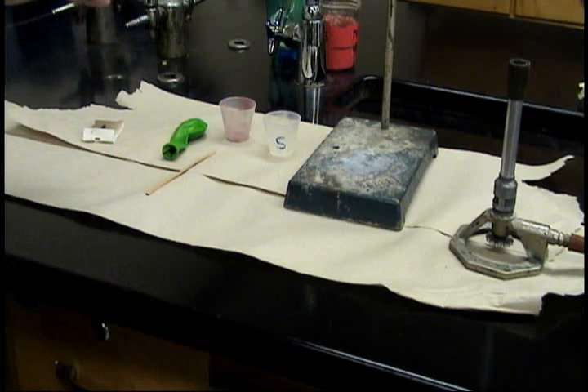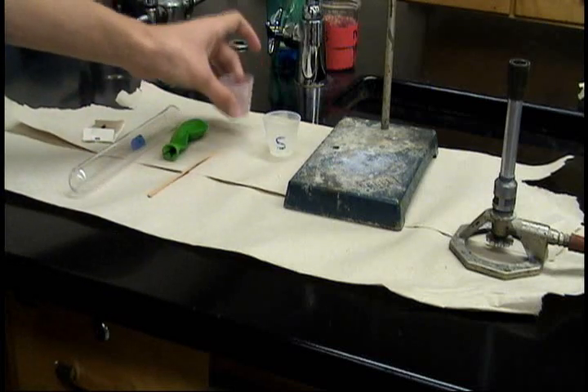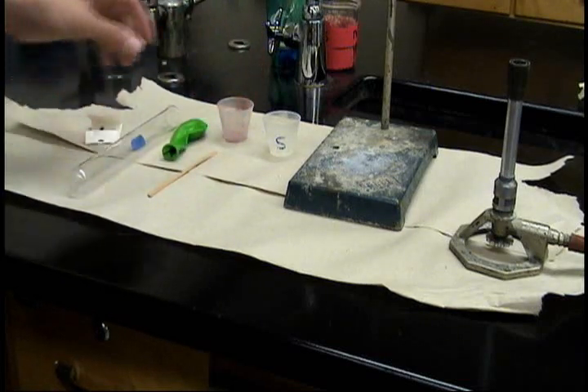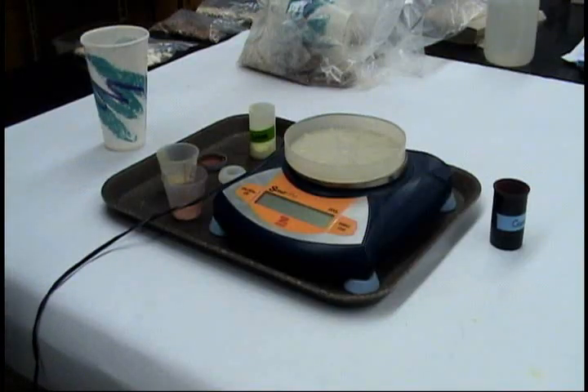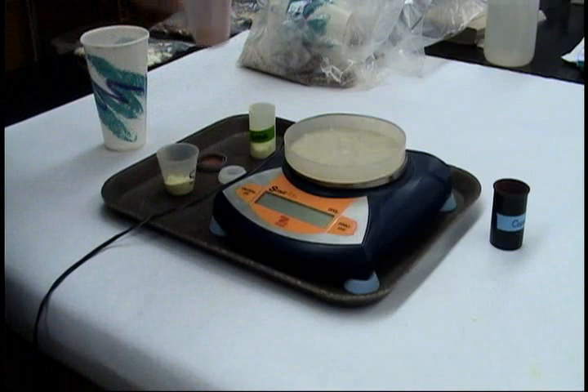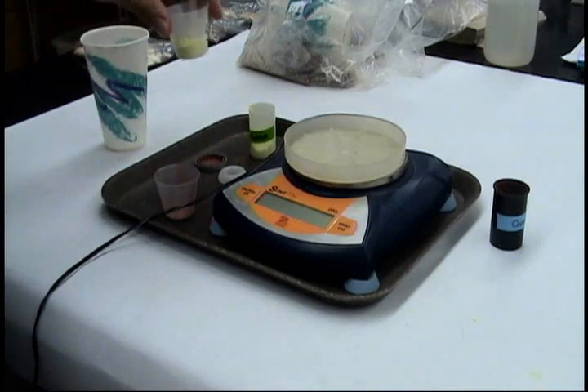Materials: test tube, balloon, stirring rod, two cups, matches, a Bunsen burner, and a ring stand. You also need six grams of granulated copper and three grams of powdered sulfur.